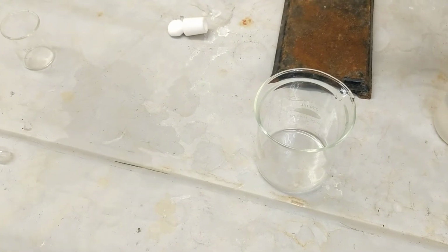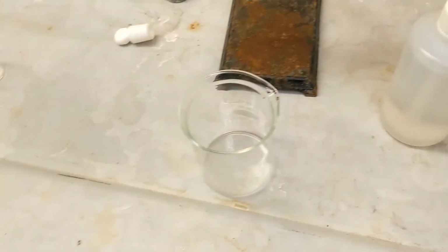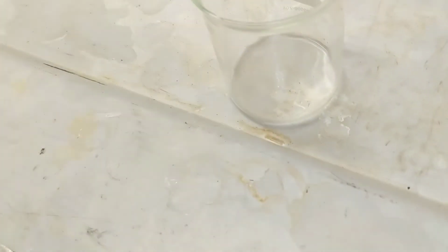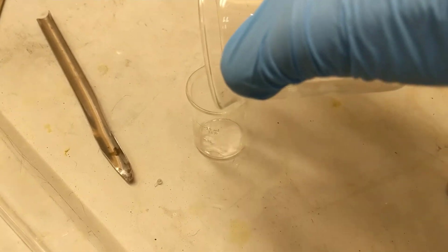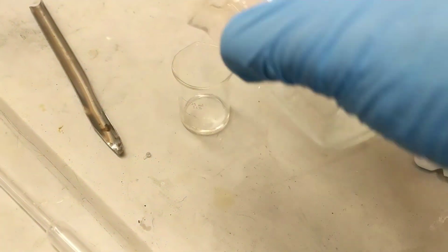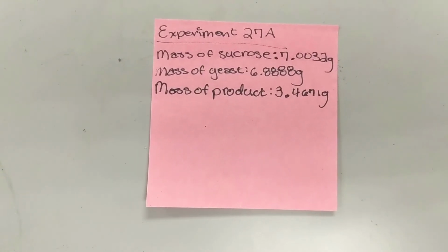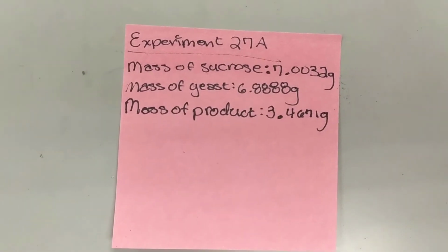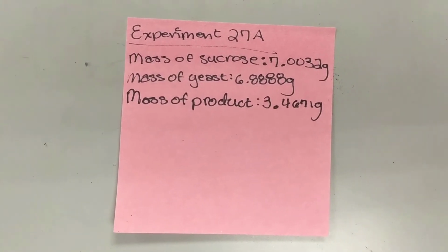Alright guys, so I've been drying it for maybe 15-20 minutes, just like this. I've got a pretty consistent amount in there. You can see it's about 1 to 2 milliliters. Not a lot, but you know, a measurable amount. I'm just going to put that into my pre-weighed tiny beaker, and I'm just going to weigh this out. I'll show you guys the results. Alright, this is the final data, at least for the percent mass is what you'll need. I'll attach the spectroscopy in the next clip, but here you guys go.